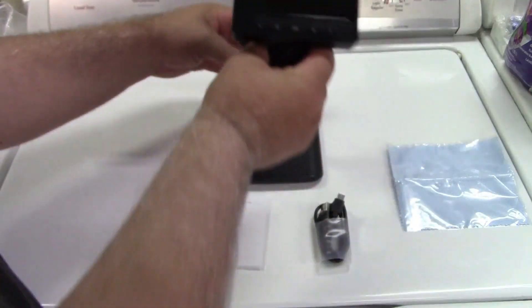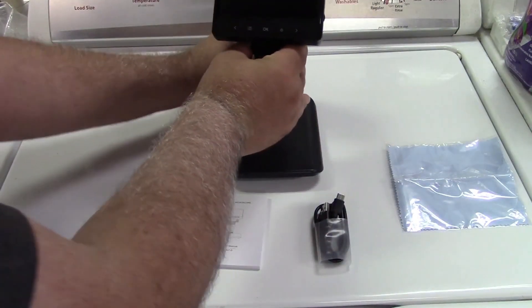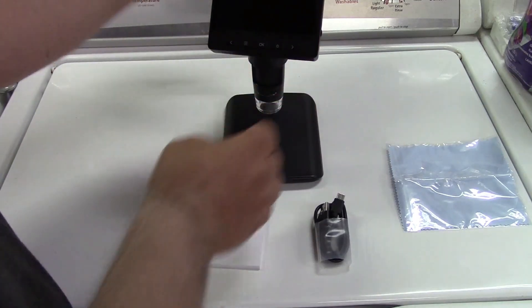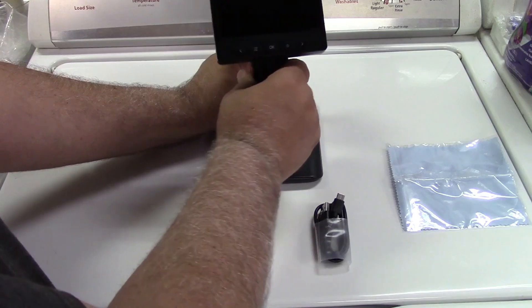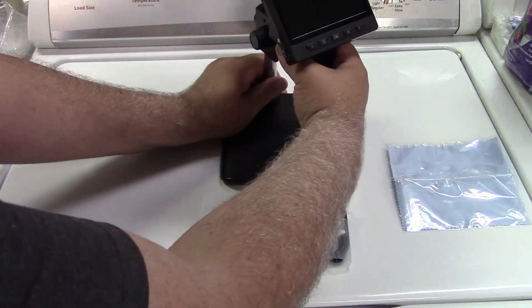Tighten that down, not too tight. Take the base. And then you can just jam that on down in there. Here's your scope. You can turn it.